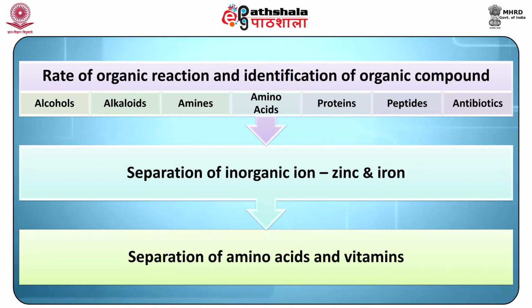Rate of organic reaction. Identification of the organic compounds such as alcohols, alkaloids, amines, amino acids, proteins, peptides, antibiotics, etc. Separation of inorganic ions such as zinc and iron, separation of amino acids and vitamins.